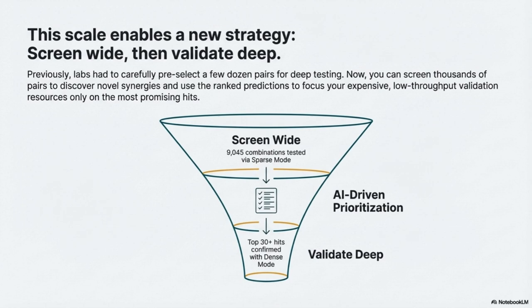Did they do a biological sanity check? They did. Their dense screen correctly identified the classic synergistic pair, sulfamethoxazole and trimethoprim, in E. coli, so it handles known biology correctly. But the real test is confirming the new hits, right? Right. And that's what they did.